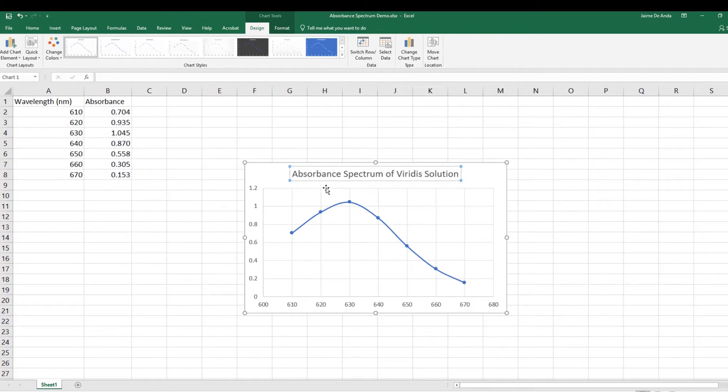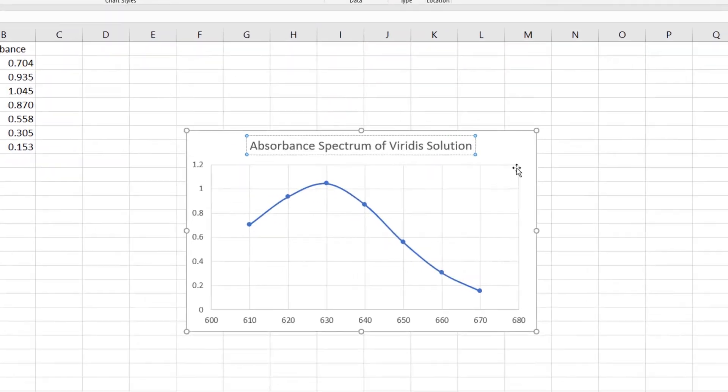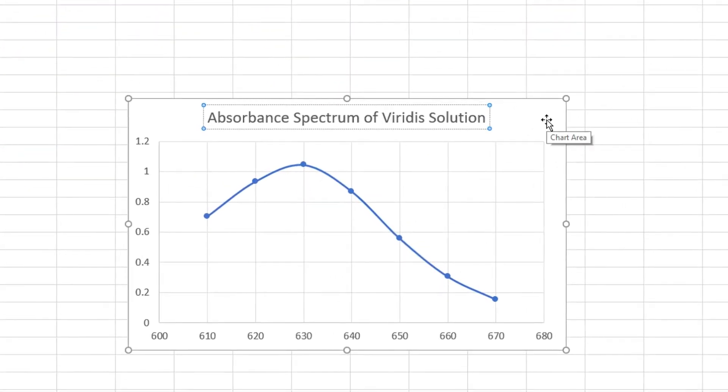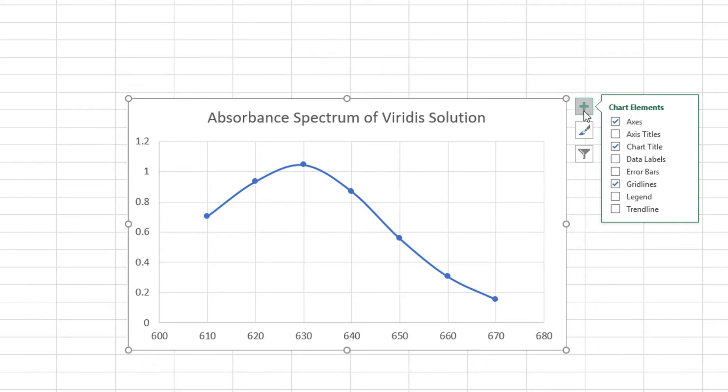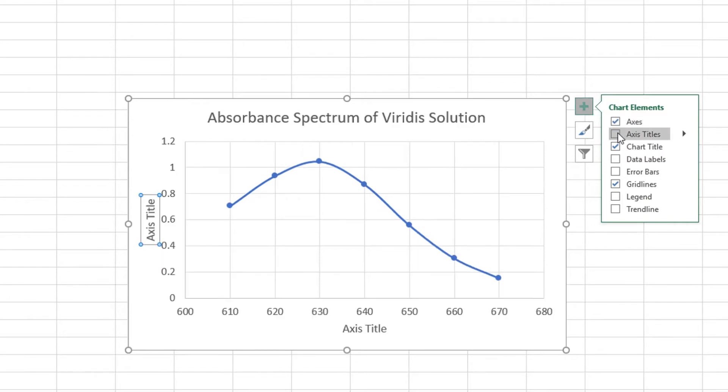Now we need to add some labels here. I'm going to click on the chart and go to this plus sign here that says Chart Elements. As you can see, I want it to show me the axis titles. When I click there, I'm going to see the axis titles and I'm going to format.